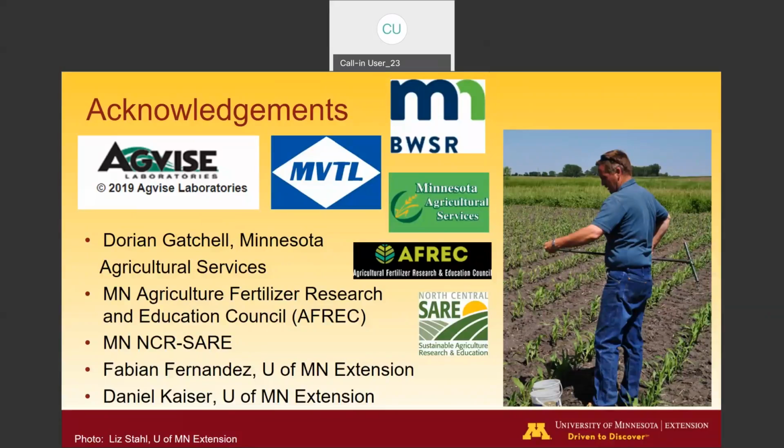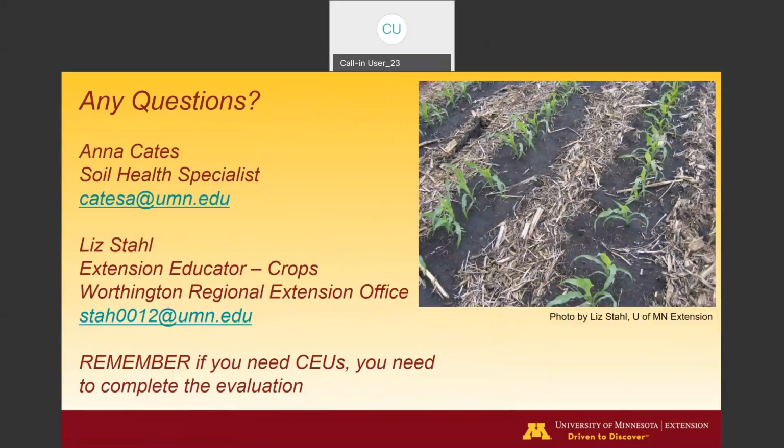Okay, thanks. And then Anna, we had a question come in earlier for you. Is the soil health equation used by Ward Labs or Haney or both? So there are a few versions of soil health score calculations out there. Ward Labs switched their calculation in 2017, as far as I can tell, and then just in looking around at the other labs that use this suite of measurements, I think there are a few soil health scores out there.